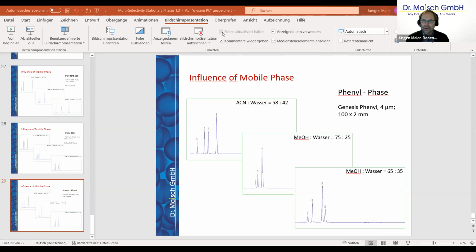And for the HILIC, the amino phases are the best choice for sugars. Which amino phase would be the best? We have different carbohydrate columns, so I have to look at the applications we have on that. It will probably be better to do it offline later. Yeah, I make a note on that.